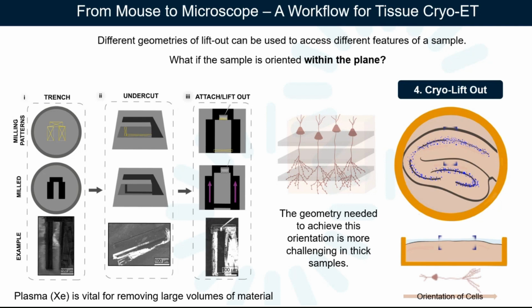And it's important to sort of follow on from Pavel's talk, where he used plasma FIB for his imaging and serial FIB SEM. We are also using the plasma FIB, the Helios Hydra, and I think without the use of the xenon plasma in particular to sort of speed up the excavation of this material, all of this method wouldn't be possible. So if a take home is, plasma FIB is essential for performing structural biology in thick specimen.